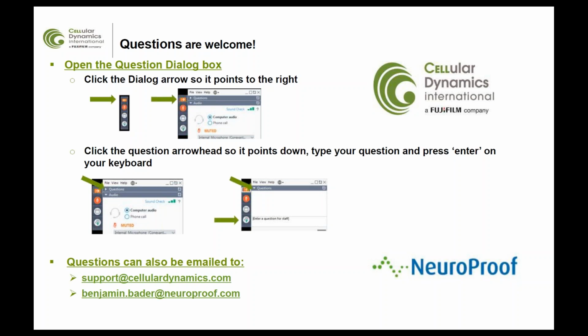Maybe that's a question which I can answer. So we have screened the iCell GlutaNeurons between 3 and 35 days. And to address this assay time point, we need a synchronization. So after 3 to 5 days, they are already active at several electrodes, but they are not synchronized. And that synchronization starts at 14 days. And we usually use those cells between 18 and 21 days, because there we have them synchronized robustly at all wells. But they can certainly be used also at 35 days and longer.